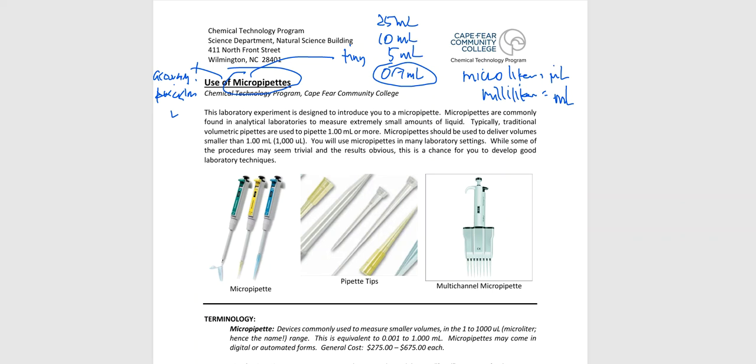In the health field, you can get micro as well, microliters, micrograms, but very often they will use MC as an abbreviation. We do not do that in a laboratory setting for the most part. We use that mu symbol, and MC is there because that mu symbol and that milliliter symbol, the M and the mu, will actually look very similar.